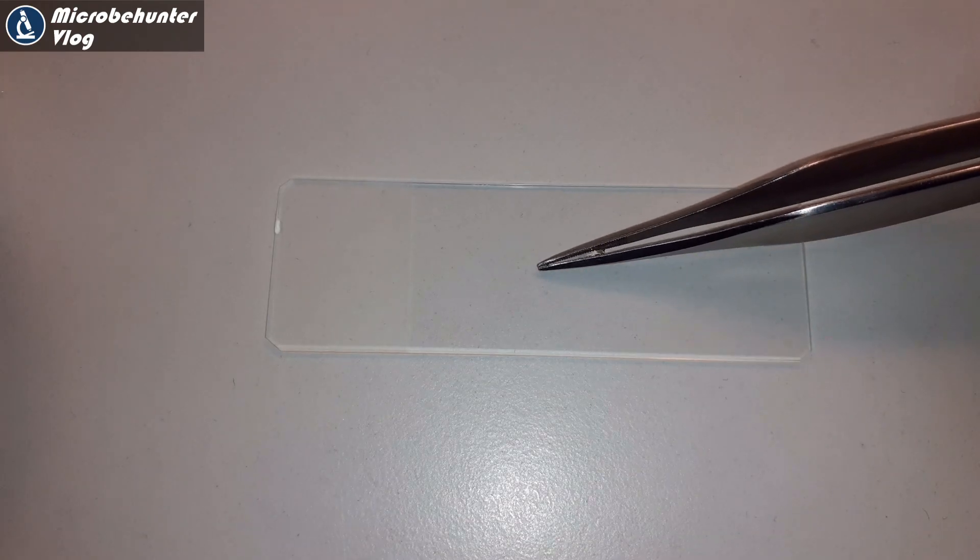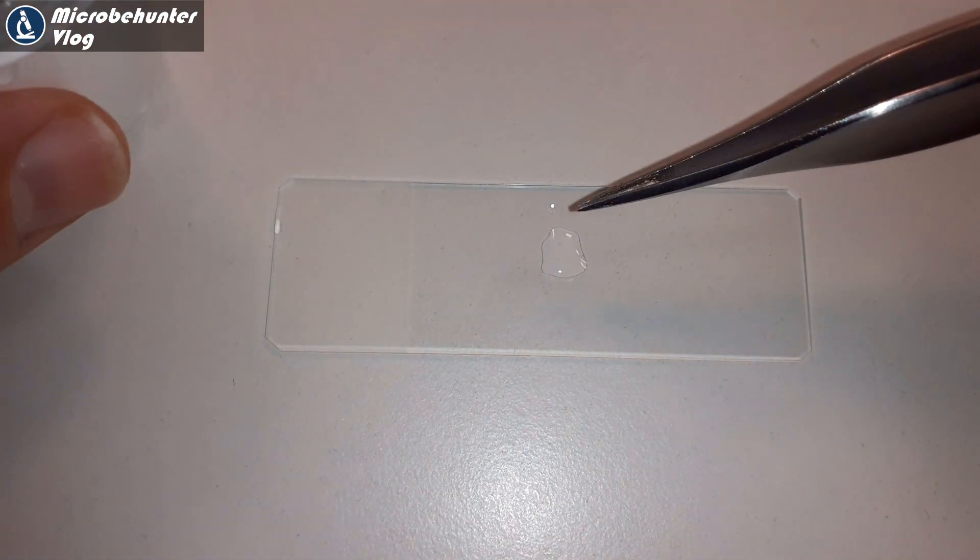These are the cells that are connected together in long strings and they are the actual mold. This mycelium actually grows into the carrot or into the medium that it wants to digest, and then the cells release enzymes.